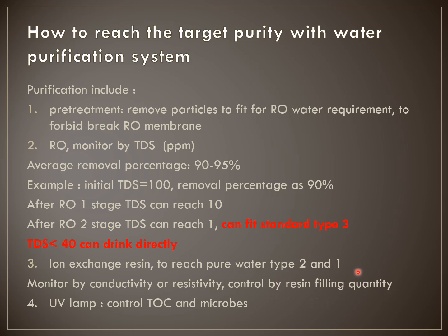and the life of the ultra pure water are controlled by the refilling quantity. So if the filling amount is bigger, we can use it longer, and later, when we come to the replacing stage, we can also fill more in the column itself and be 100% fit for our target requirement.